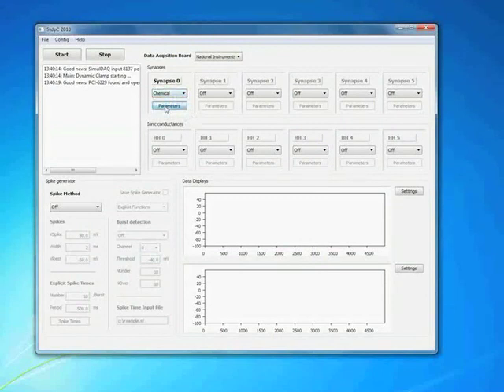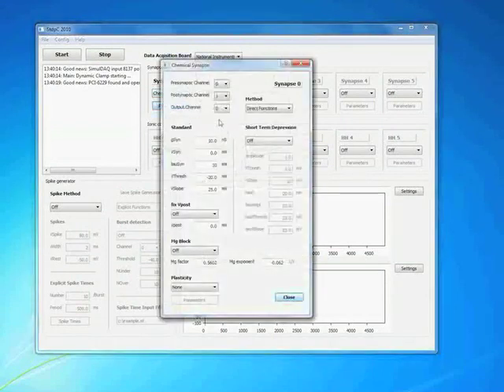And then if I hit parameters, I see a dialog like this, on which, importantly, I have to first choose the channels that are involved in this simulated component. That means I have a presynaptic channel. This is the membrane potential of the neuron that's presynaptic to the simulated synapse, and I use here channel 0. In principle, I have a choice of all the activated channels, that was 0 and 1, or the spike generator channel, which is the artificial neuron. So I stick with 0.